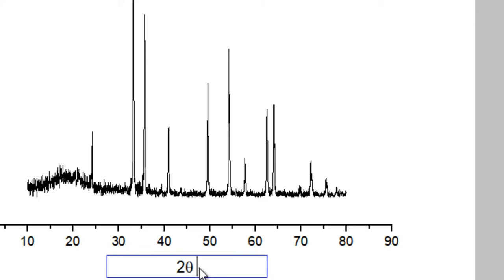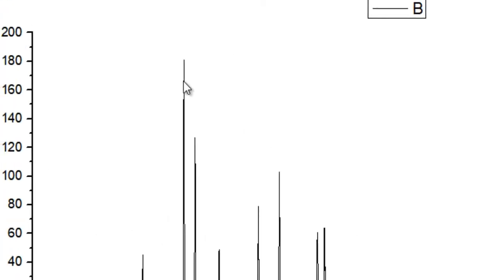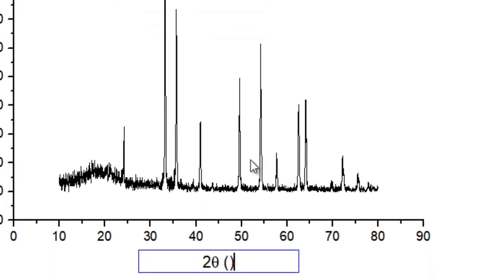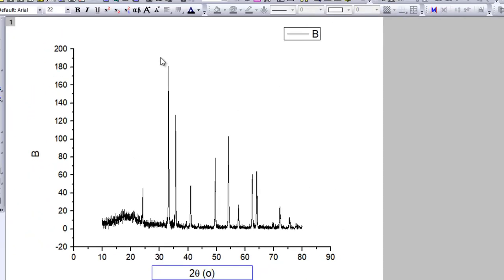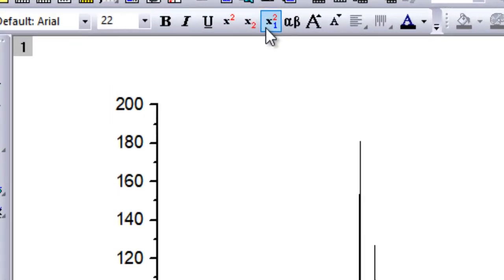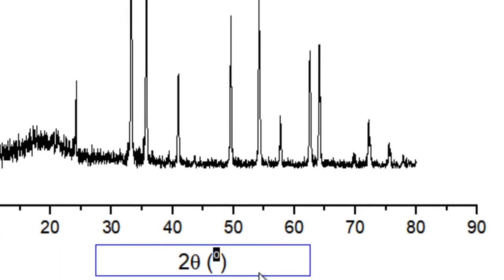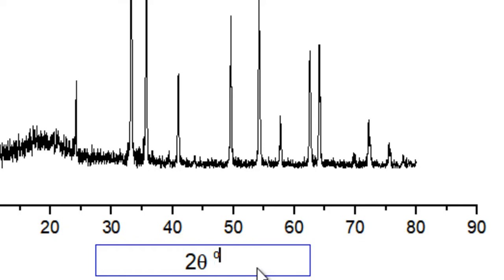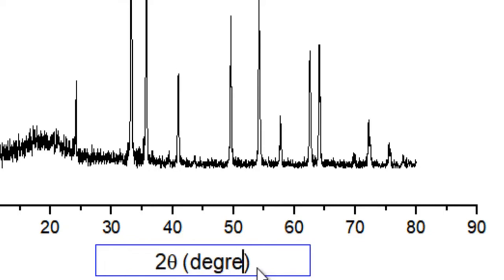Now you want to enter the units — that is degrees. You can write the degree symbol in superscript format by selecting it and clicking the superscript option, or you can just write 'degrees' explicitly. There are a variety of ways to label the X axis; whichever you prefer. I usually prefer writing degrees explicitly.